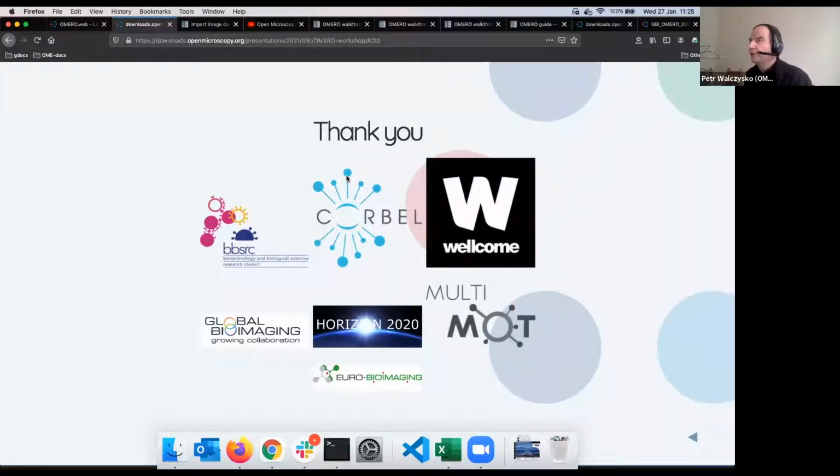To Ofra Golani, regarding in-place import, can I have several different remote storage servers linked from Omero? Yes, you can. You simply mount them on the machine where the Omero server is installed. Is there a limit in data size that can be used? No, there is no limit. And how much space is allocated to a user? Okay, this is a question which shows that the whole ecosystem is not completely understood. So let me make sure that we understand each other here.